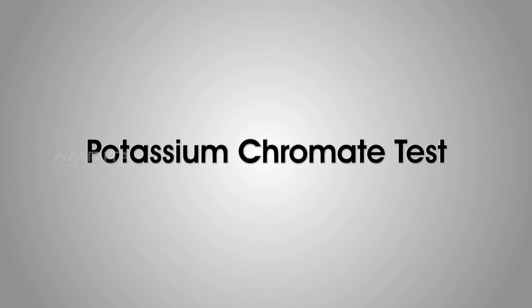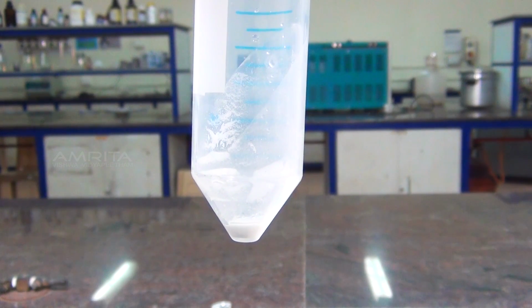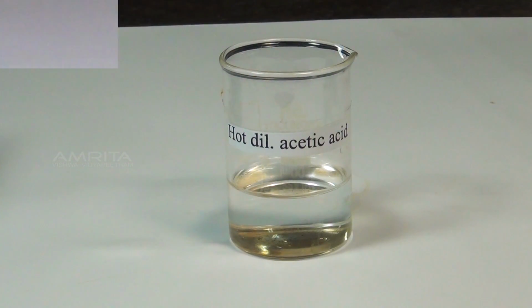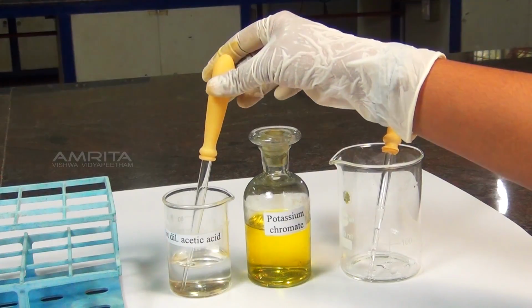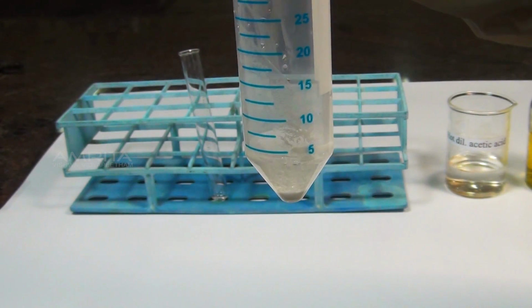Finally, we look at the confirmatory tests of the barium ion. Potassium chromate test. Materials required: precipitate obtained in the group analysis, hot dilute acetic acid, potassium chromate solution, and droppers. Procedure: take the precipitate obtained in the group analysis. To this, add a small quantity of hot dilute acetic acid using a dropper.